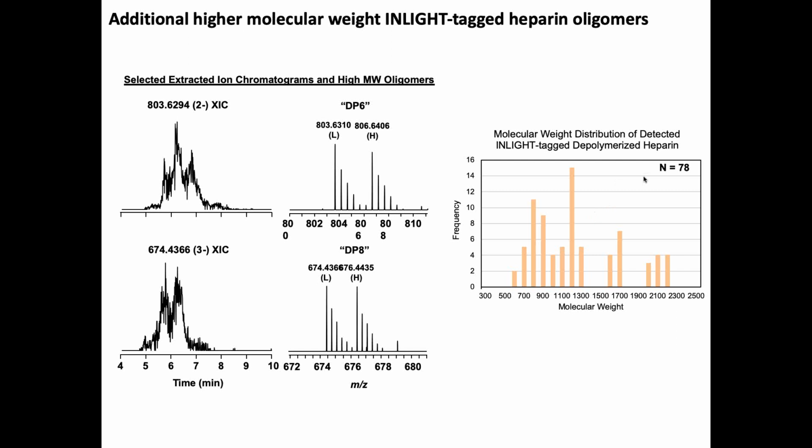And I just feel like I'm in the deep end, just trying to keep my head above water. In proteomics, it's like, oh my gosh, there are databases, I've got Sequest, I can just submit my data, go get some coffee, come back, and maybe it's got the data ready. There's all my data nicely tabulated, identified, ready for my Nature paper to get rejected. Go into something like this, and it's a hard grind to get through all the data. There are some academic pieces of software out there that do okay, but nowhere near the ability to really identify them and also detect which things are different.